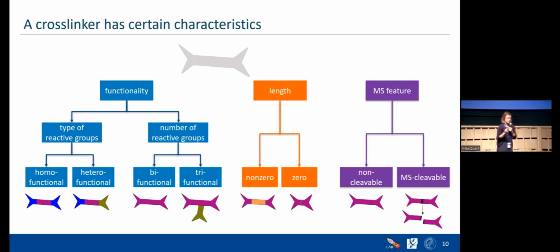What happens on the instrument: in the beginning there is a smaller energy and then the crosslinker is cut. When it's cut, smaller pieces remain attached to the peptide, and it will measure a peptide with a partial crosslinker. It's of course also possible to have the other part of the crosslinker, so again you will have the peptide and crosslinker measured. These 2 just have different functionalities, different applications.